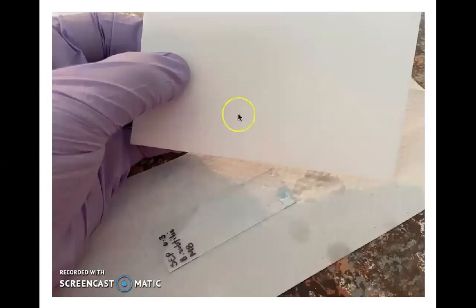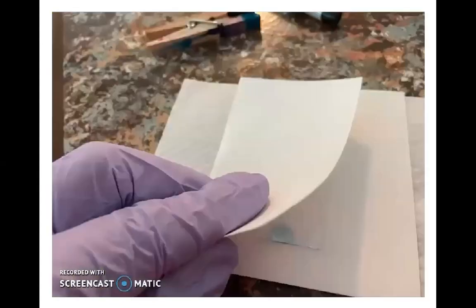So you use one of these pieces to blot your damp slide and get it prepared for observation under the microscope. All I've done here is fold the Bibulous paper over, and I'm just going to gently press it down onto the surface of the slide so that I wick up as much of that moisture as possible.